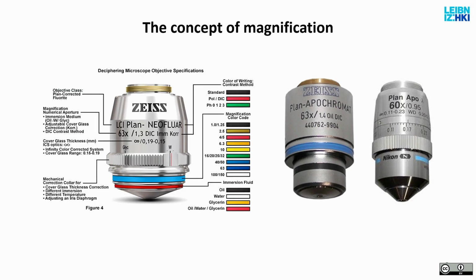And this is a very, very practical lens. It's very expensive. It's about 20,000 euros or so, when it's new. And for a lab or microscopy facility, this is very, very useful because I can match the refractive index of my sample really well.